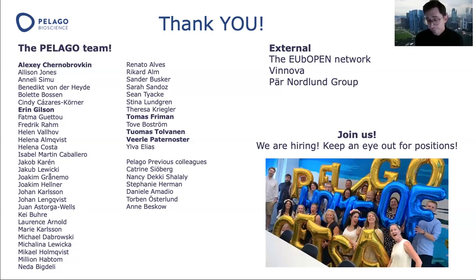Yeah, and I think that with mass spec, which this talk was quite a lot about, we are very dependent on how the mass spec hardware field is moving, and what we can do with machines in 5 years' time is probably going to be quite different from what we can do now in terms of resolution.